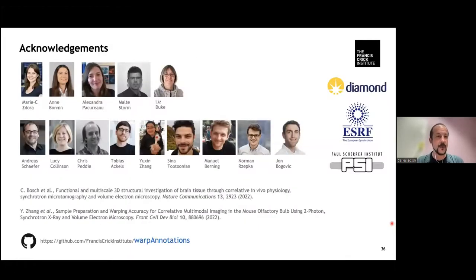And with this, I would like to dedicate 1 minute to this most important slide. First, what I've been presenting today is a piece of work that has been released this year in the form of two papers. Feel free to browse through them and get in touch if there's anything you might want to know more about. All the data sets shown are freely available through this repo, and there's a bit more insight you can get, but also there's the toolbox that we are using for annotating, integrating big warps, warping tool with WebKnossos's skeleton system.